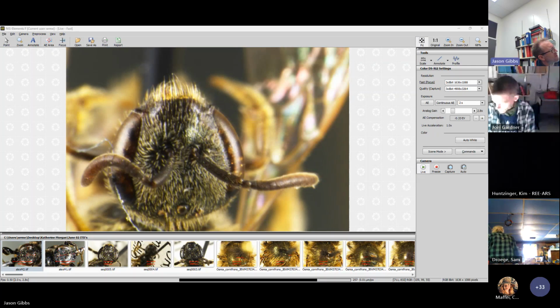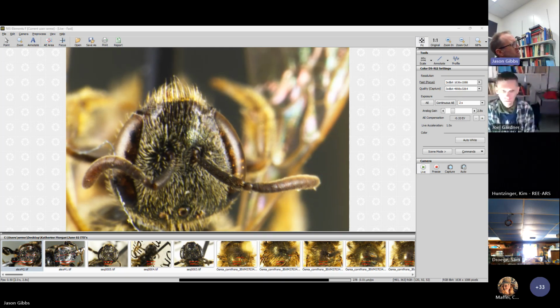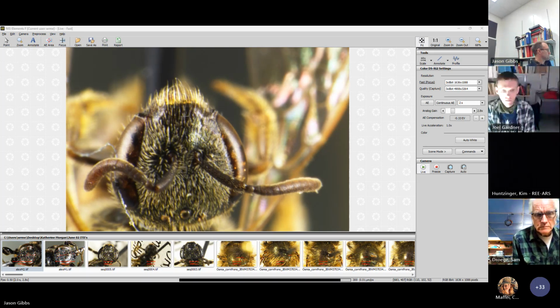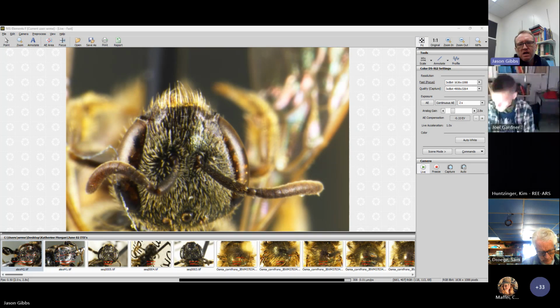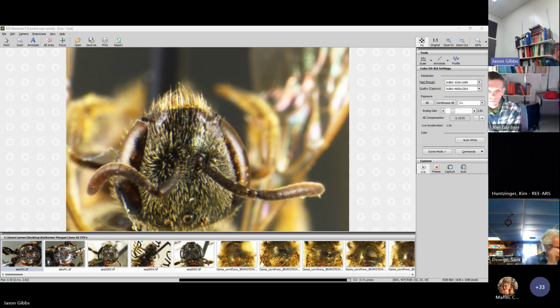This should be, in theory, a trigeminum. The clypeus sticks out a little bit, but not very strongly, so you'd be forgiven. This is almost more in line with what you see in a versatum. Nothing particularly unusual about it.